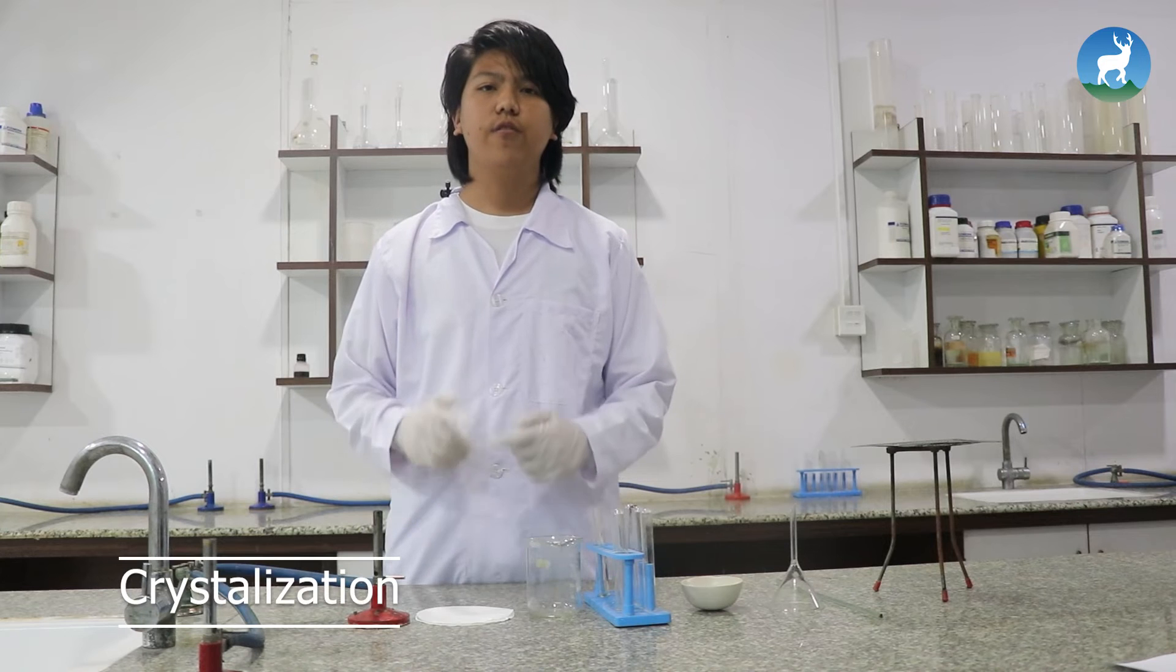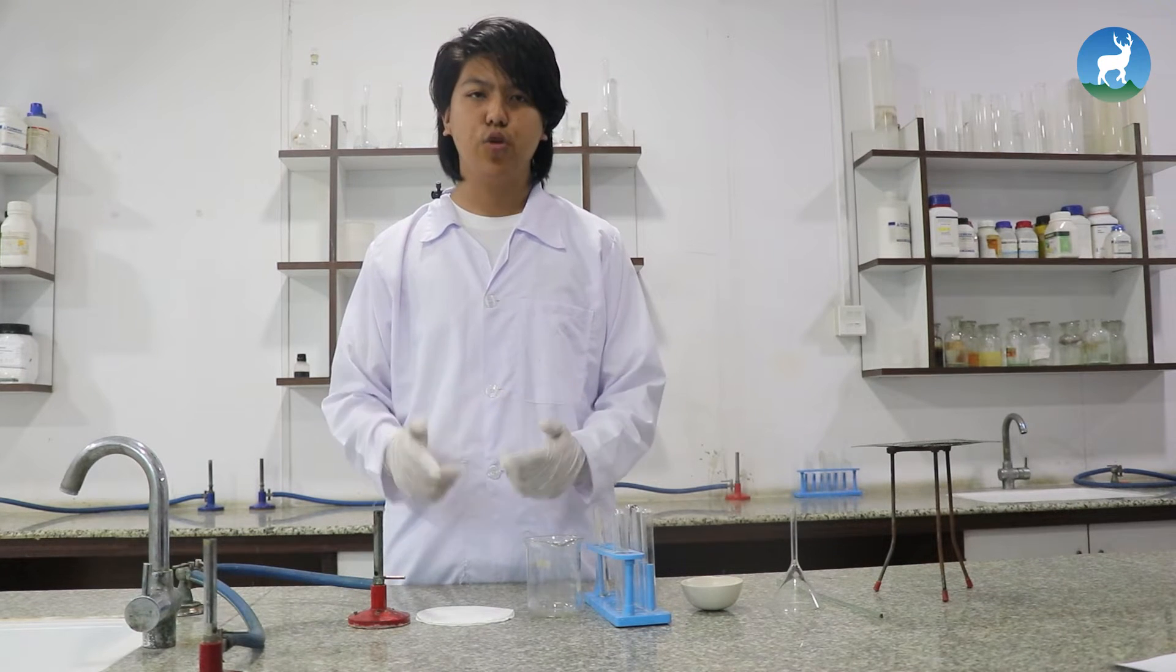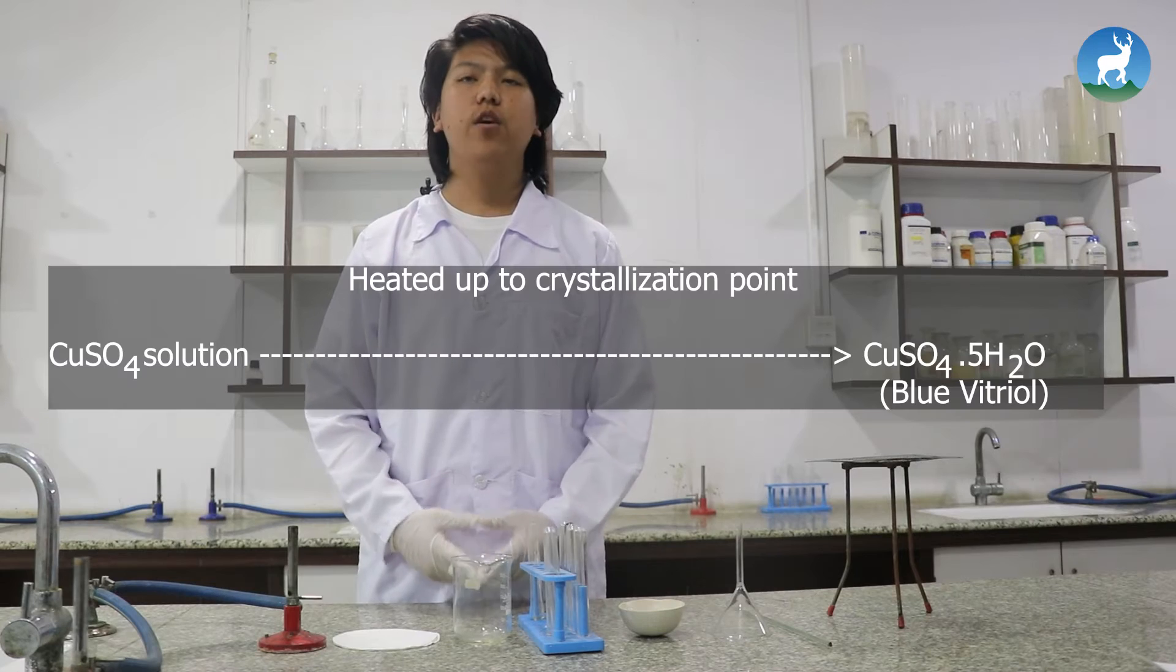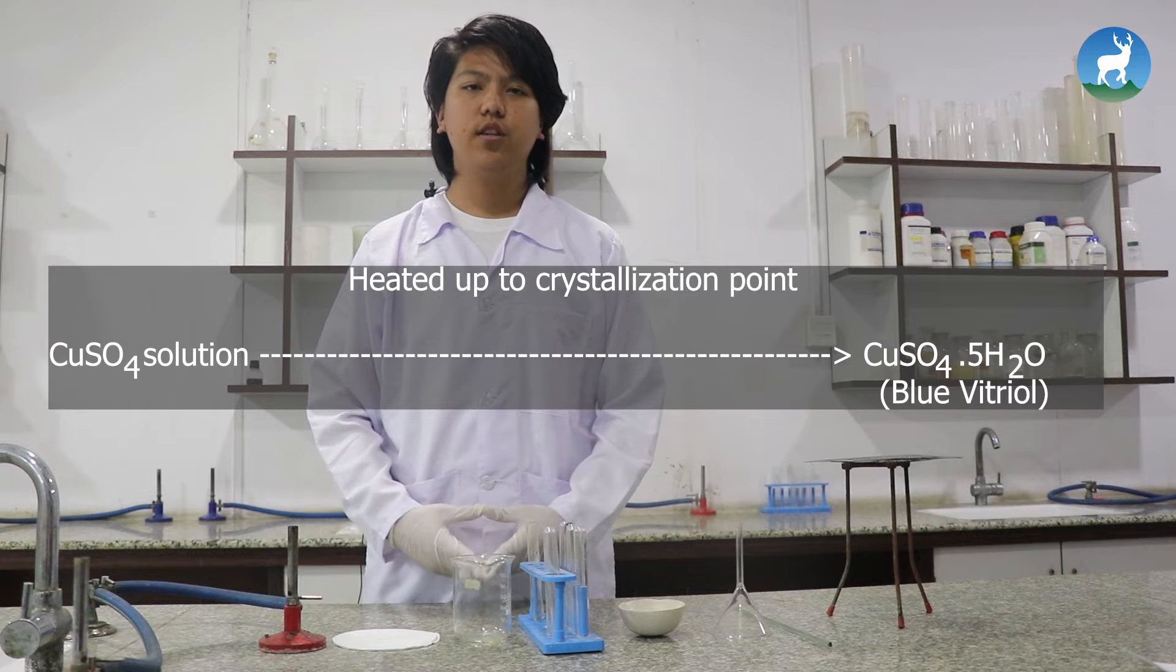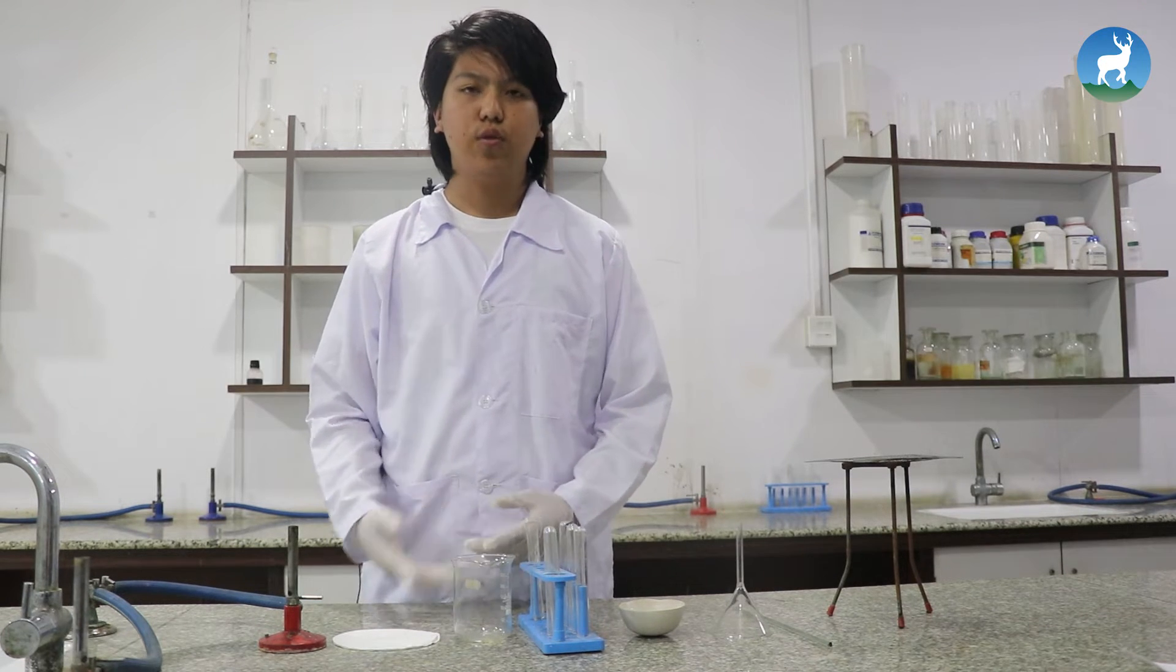Crystallization is the process of formation of crystals by evaporating each solution to its crystallization point. The crystallization point is where fine crystals are formed when a solution saturated at high temperature is cooled down to room temperature. If copper sulfate solution is heated up to its crystallization point, then we will get crystals of copper sulfate, also known as blue vitriol.